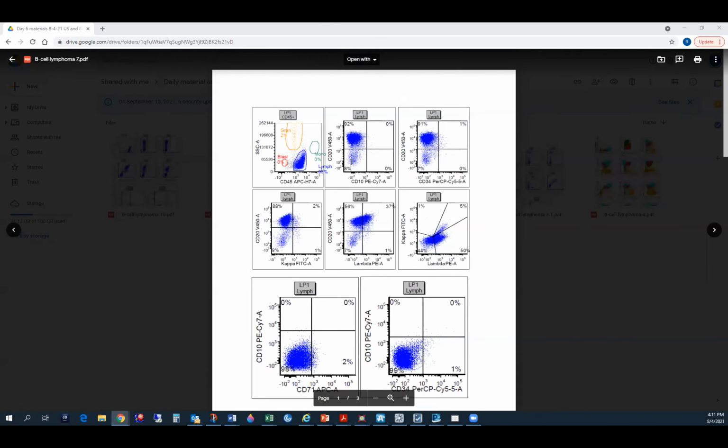So we'll go more over this. What is a little different from hairy cell leukemia in this one? We'll see the similarities and the differences. In CD45 versus side scatter, you see that these cells have a little more side scatter than what we traditionally see in lymphocytes. That is because hairy cells usually have higher cytoplasm, and variants also have more cytoplasm, just like hairy cells, and they do have projections also. And monocytes are nil. We always see monocytopenia with hairy cells, and if you do not see monocytopenia, you have to take a step back and make sure it is hairy cell.